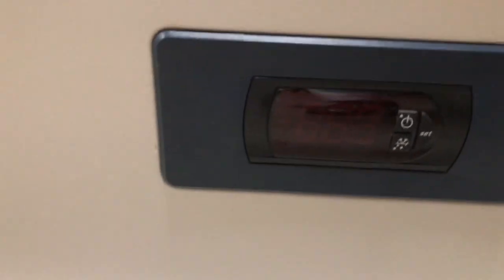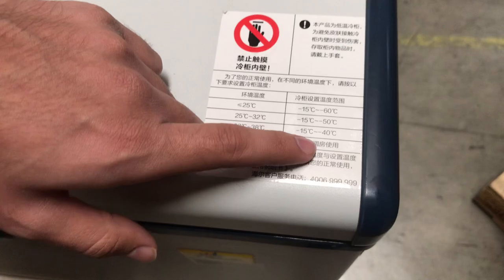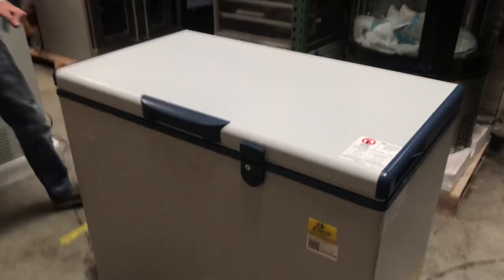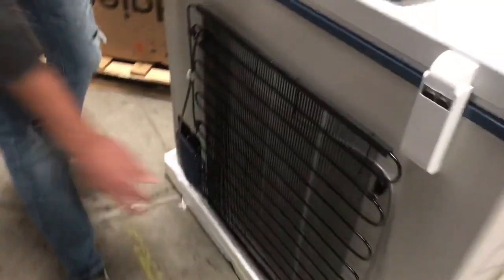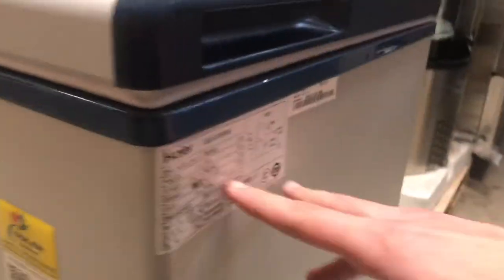It also has a temperature panel in the front, so you have the option of changing the temperature to whatever you would like. The temperature range for this unit is from negative 15 Celsius up to negative 60 Celsius. Over here on the side, you have more information on the unit in terms of the electrical specs. This unit runs on 220 voltage — the plug is located in the back. On the side sticker, it shows 2 amps, 50 hertz wattage — all that information is right there.